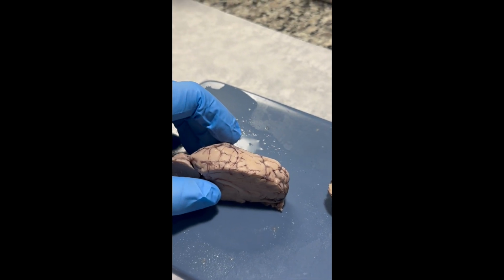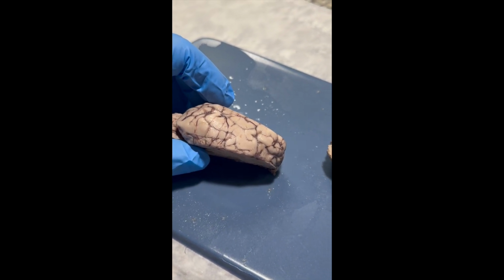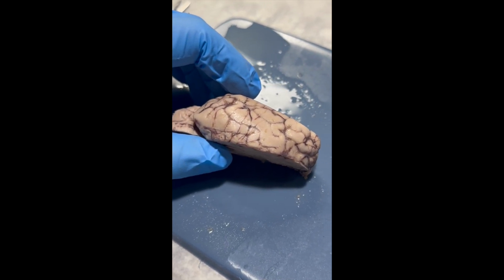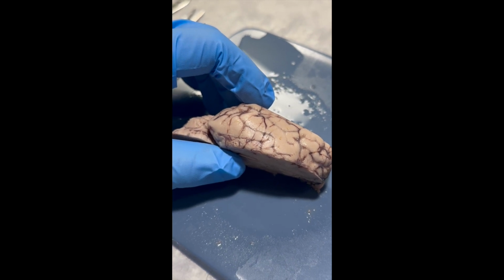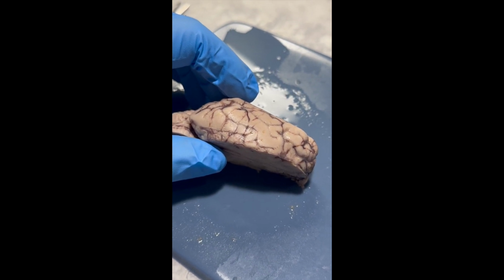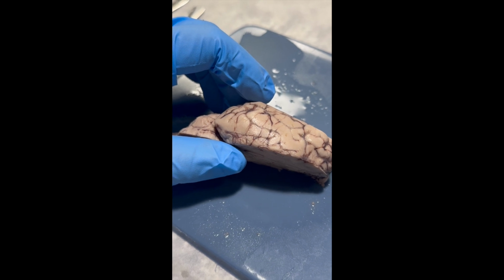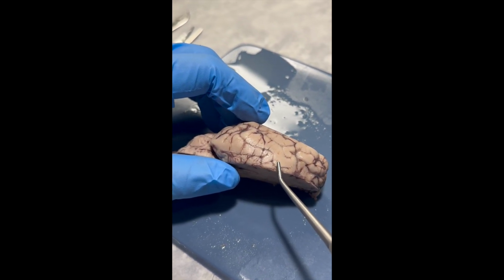So just to start out with, we're going to talk about the meninges. On this specimen, there is no dura mater, which is the outermost meninge. There's two in the cranial cavity, and it is responsible for holding in the cerebral spinal fluid. The middle meninge is called the arachnoid. Again, on the specimen, there is none, but within this layer are many of the blood vessels that supply blood to the brain. And then the innermost meninge is called the pia mater, and this hugs tightly to the brain.